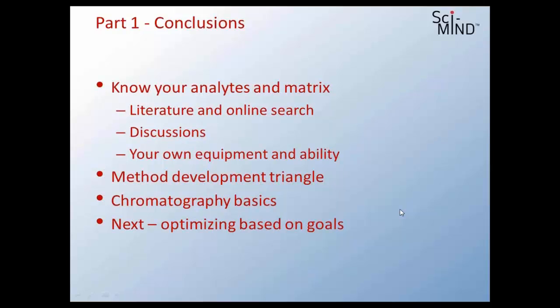I love the question, Jeff, and that's actually one of the areas that I'm very interested in in my own research as a gas chromatographer, always looking for ways to really extend the utility of GC. I think there are a lot of compounds. I do a lot of work, for instance, in drug analysis and drug of abuse analysis. So for your pharmaceutical folks out there, relatively small molecule APIs. And what I've found is that, in that industry where HPLC really is king, I did a lot of GC work with them in developing methods for the same compounds that were complementary that they might use in an investigative process when they ran into trouble with an HPLC method. The GC method could then be used as a backup or to assist them in looking at the data and looking at those compounds in a different way. Okay. I've got a few more comments from the literature here.